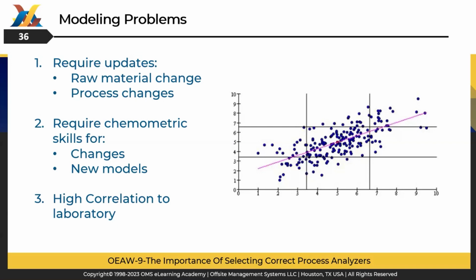Finally, what we are looking for is the best correlation between the laboratory, which uses a standard method of analysis, and our analyzers. That, of course, if you trust the results of your laboratory, which is a must. So one of the biggest concerns related to the process analyzers operators is how they can solve these problems. I mean, how they can make models always updated, and how they can also control the process of model building if they need, for example, to build or update a model manually.